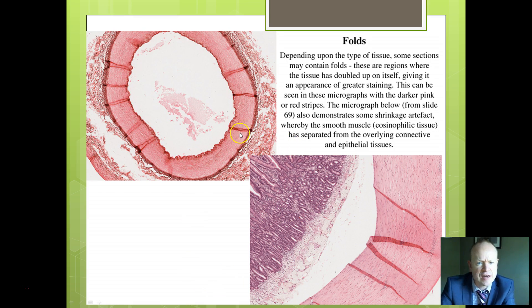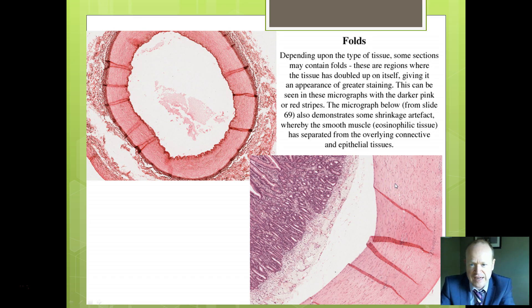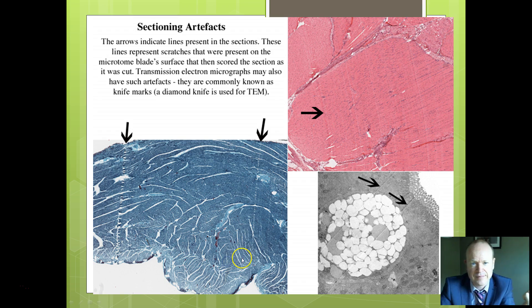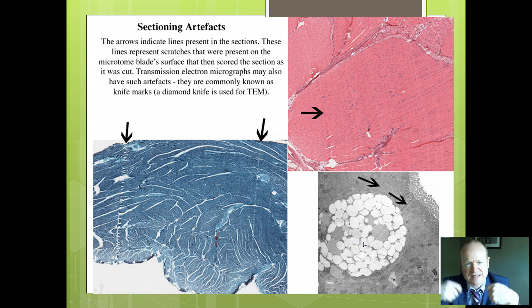Here you can see folds, and here some shrinkage — a space has appeared which shouldn't really be there. And when you slice something, these lines are from the microtome that has scratched the surface, producing artificial images as part of the artifact of preparation.